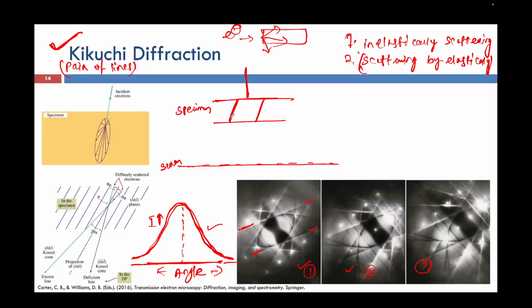Now this diffraction at point P, this is my incident electron beam, and this is my specimen, and in my specimen I am considering two planes. So first I said that this will be inelastic scattering, and then followed by inelastic scattering there will be elastic scattering. When I am talking about elastic scattering, that means it will only change its direction. So here I am considering that this scattering which will occur after inelastic will occur by following Bragg's law. So this thing I am assuming.